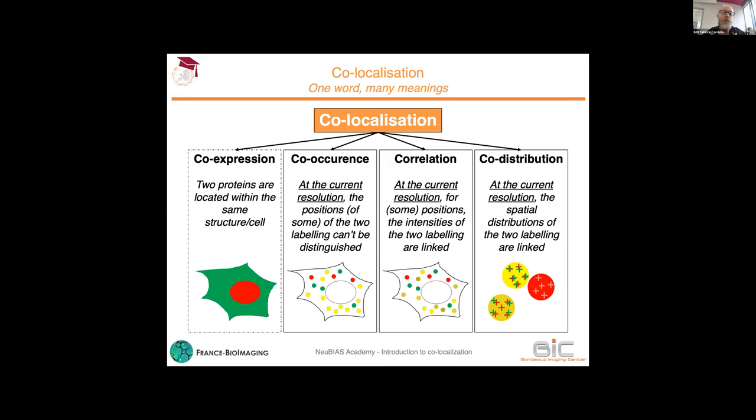Here, you are not expecting the two signals to be at the same location, as you would when talking about co-localization, but you are expecting the two proteins to be in the same structure or in the same cell.